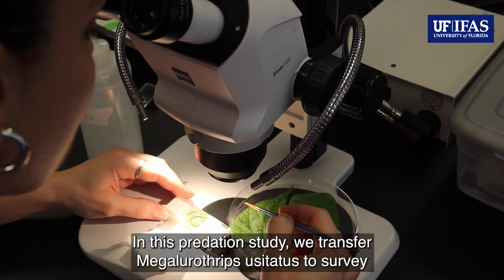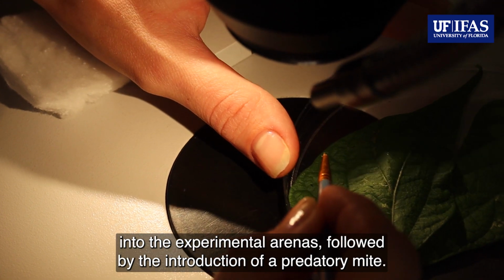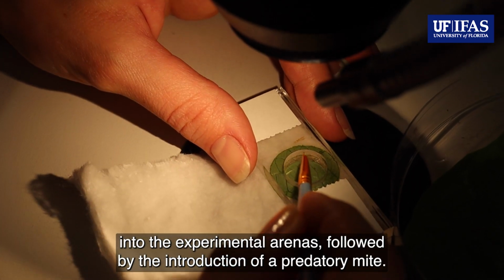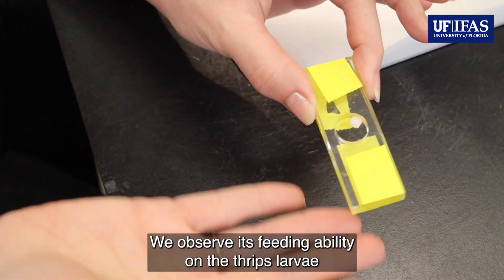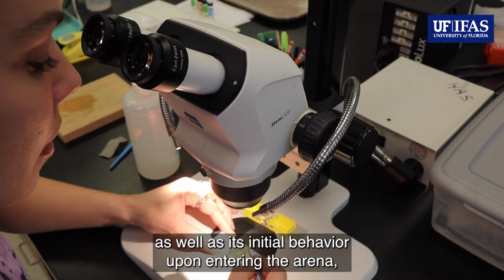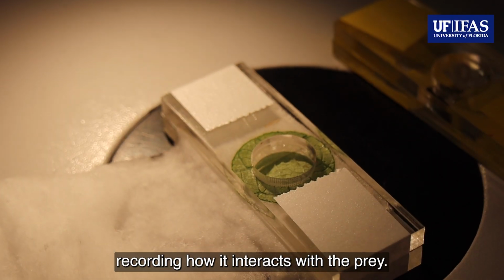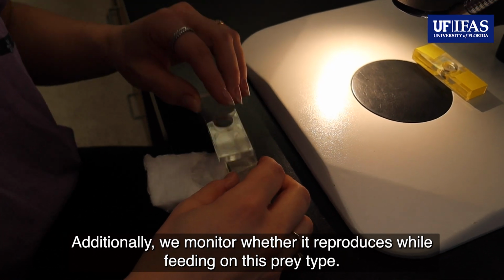In this predation study, we transfer Megalurothrips usitatus larvae into the experimental arenas, followed by the introduction of a predatory mite. We observe its feeding ability on the thrips larvae, as well as its initial behavior upon entering the arena, recording how it interacts with the prey. Additionally, we monitor whether it reproduces while feeding on this prey type.